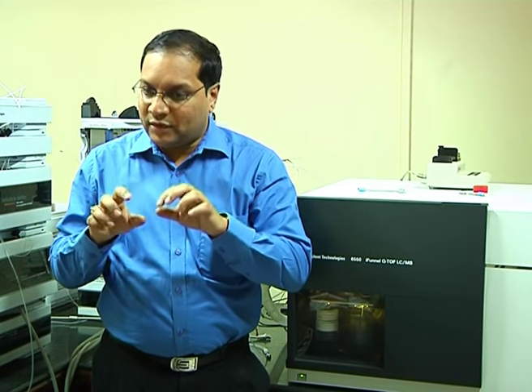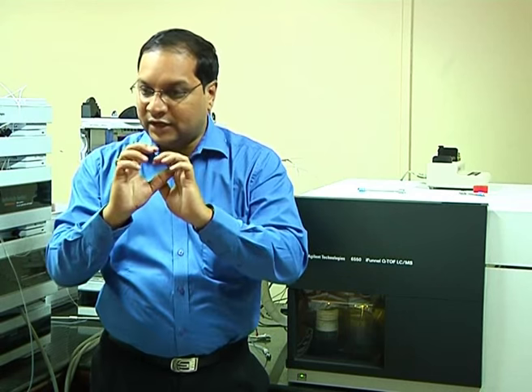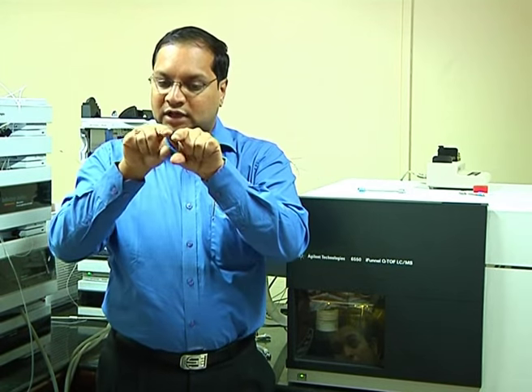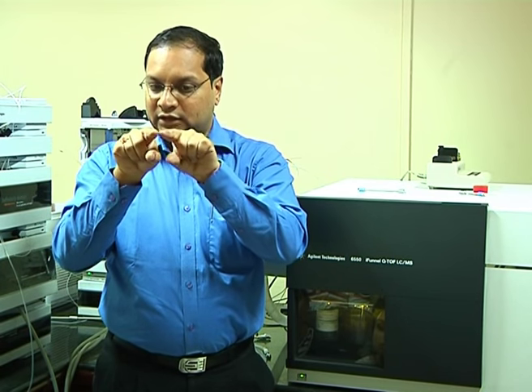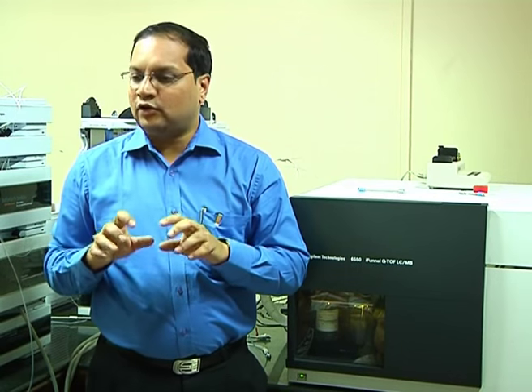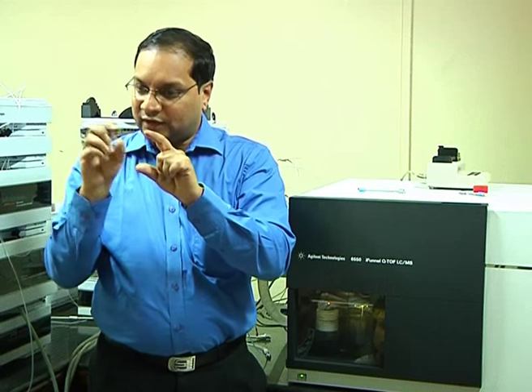If you say look for mass of 500, it will filter everything away and only allow 500 to get inside the quadrupole and travel through 4 rods. How does it do that? These 4 rods are at different electronic states like RF and DC voltage. For example, this rod and this rod, alternate rods, are in RF mode. The moment I say look for 500, as a user, I will say only 500. But the electronics understands how much electrical energy it needs to attract mass of 500. So it will apply that.